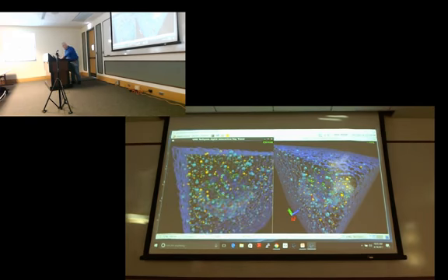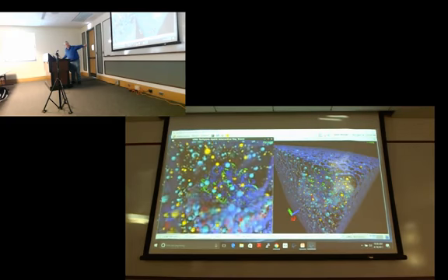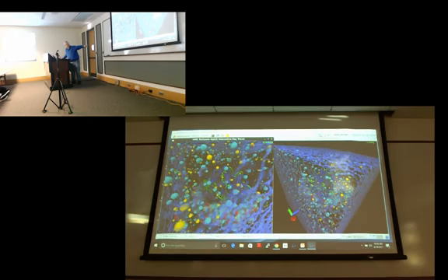And now I can turn on the depth of field, and let's fly inside the solvent box. Now, when I'm moving, you can see those spheres look very speckly, but if I let go, they will refine and start to get progressively smoother.